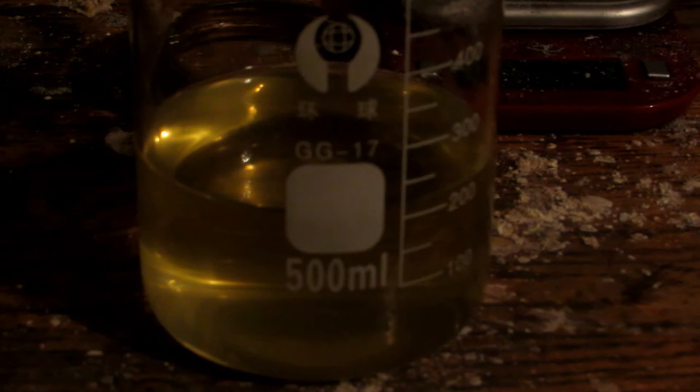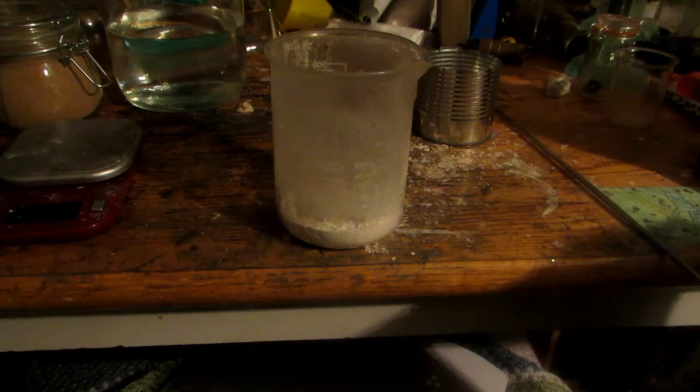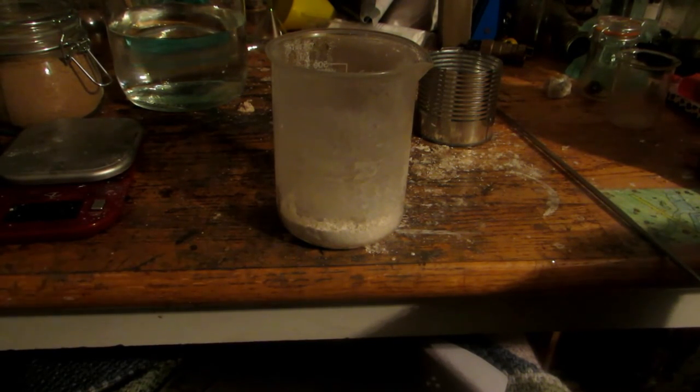We should actually be able to do a recrystallization of this to further purify our sodium silicate. First, we must boil our solution down, then weigh the crystals. Alternatively, you could just keep boiling your solution until it's extremely saturated — it becomes quite viscous when saturated. After boiling down the solution, halfway through a lot of precipitant formed with an ugly blackish-green color. I'm assuming this was most of the impurity, so I simply did a hot filtration and filtered it off.